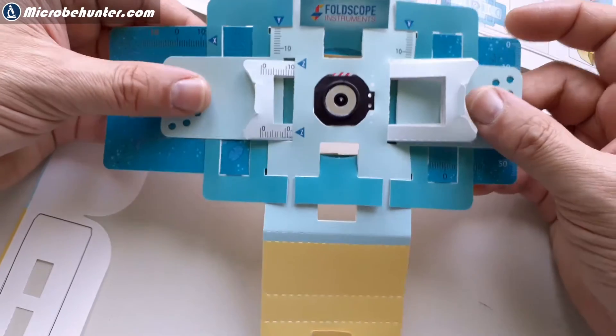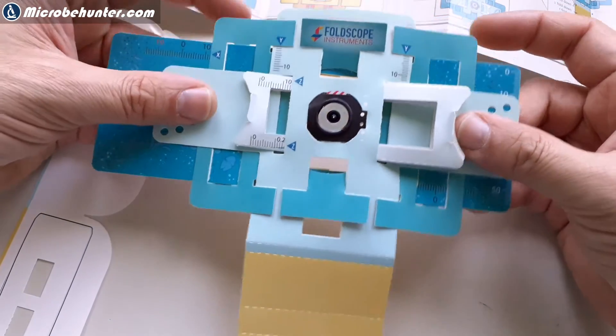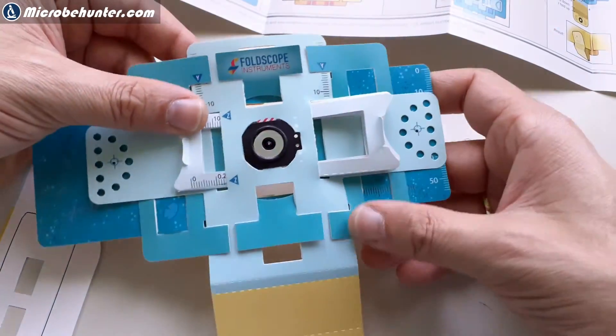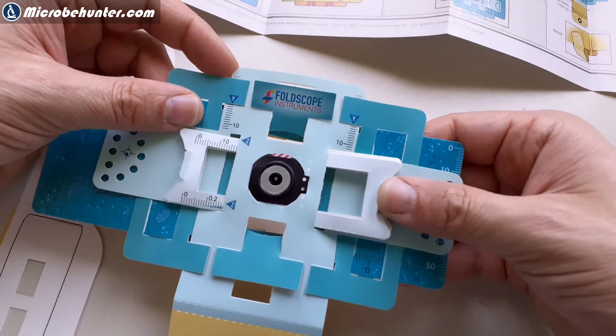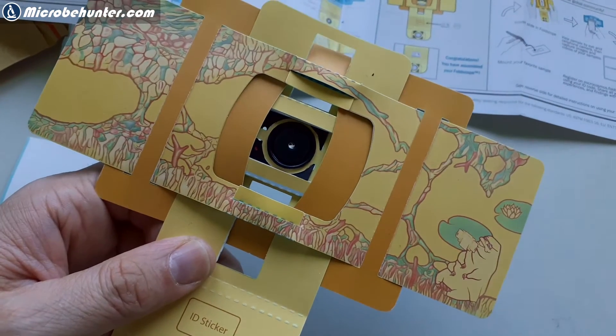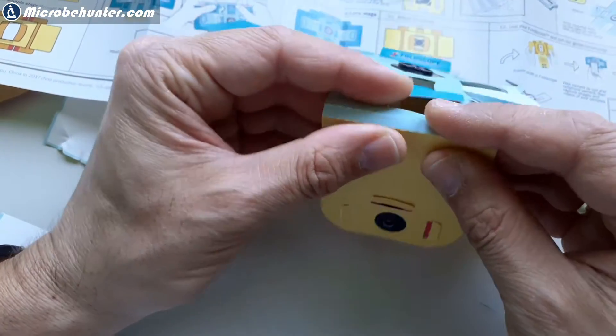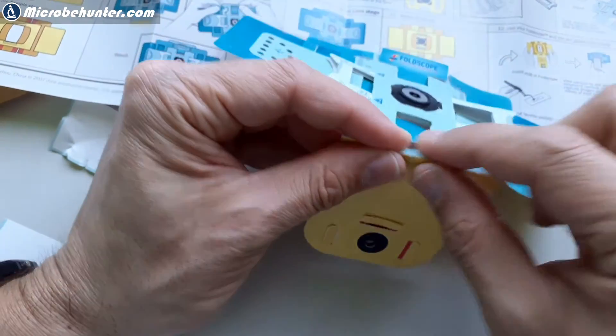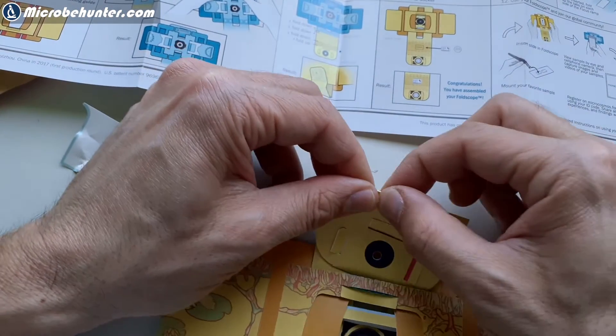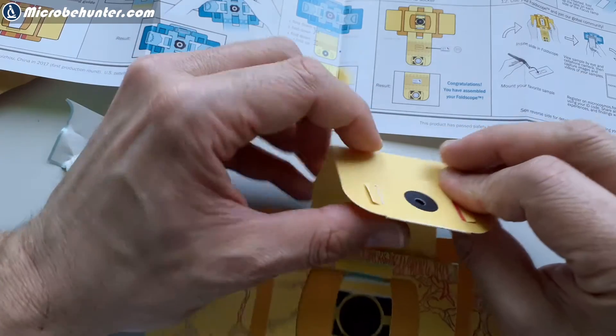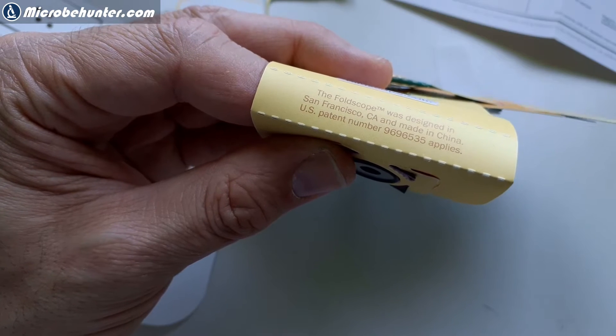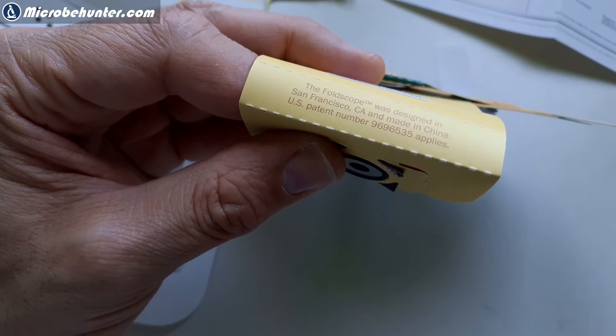But one of the reasons why I was interested is, of course, because it's a well-known thing. And also, I wanted to know a little bit is, how is it actually to look at a specimen through a single lens? And what did actually, what did the early microscopists who used single-lens microscopes and who made their own lenses, what did they actually see? And to my big surprise, I'm going to show you later. Yes, it is possible to see bacteria. I've got a stained slide with bacteria on it, so the contrast is pretty good. And it's a China microscope. By the way, the Foldscope is a China microscope, I figured out. Made in China. And those bacteria can be seen as well.